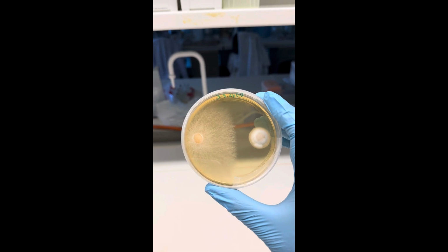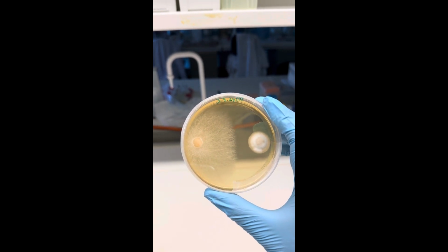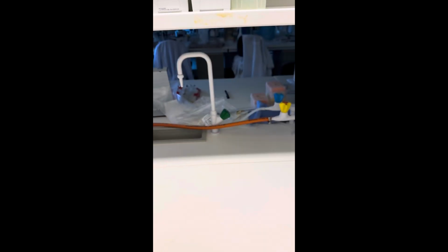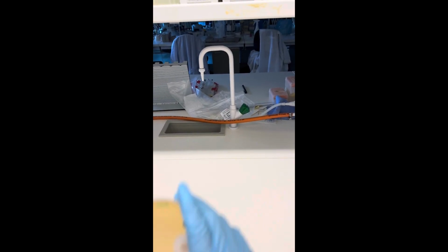So this is another one. Here we can see that the gap is still larger. So probably this is a better candidate than this one.